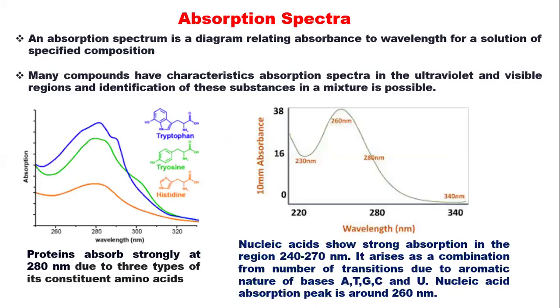Today we are going to be discussing an introduction to absorption spectrum, which you are going to carry out in the lab. We already explained the concept of absorption spectrum when we were discussing Beer's law and Lambert's law. So this video is going to be a build-up on the previous lecture.